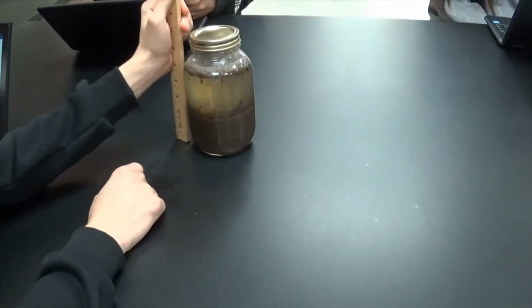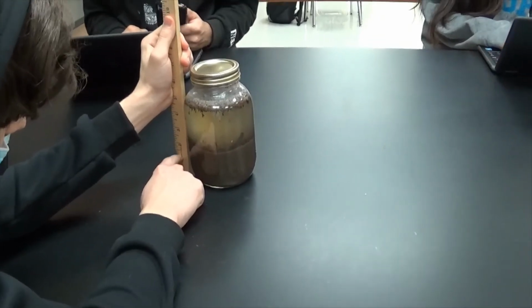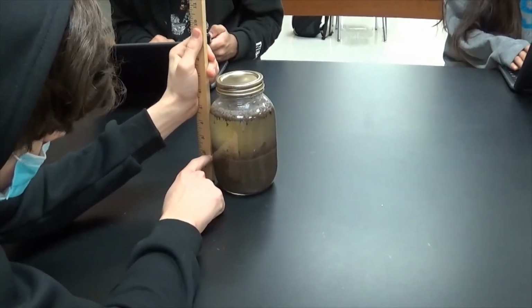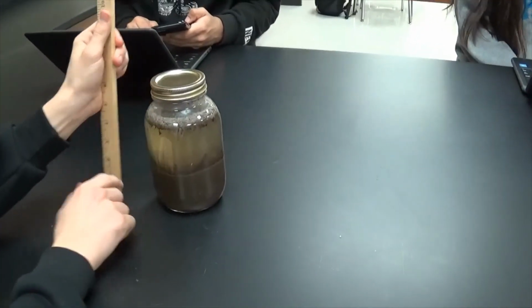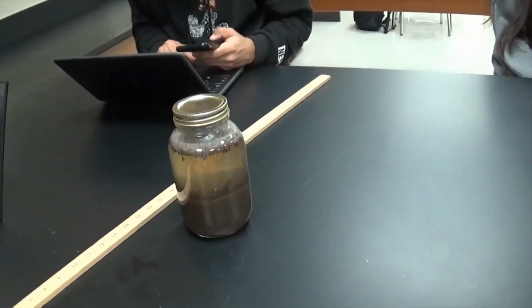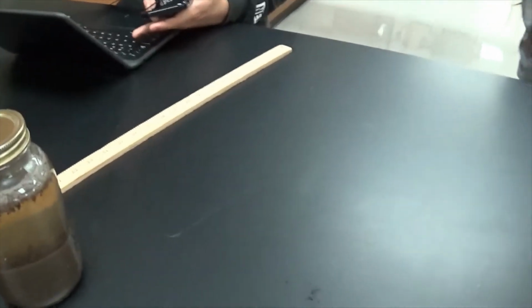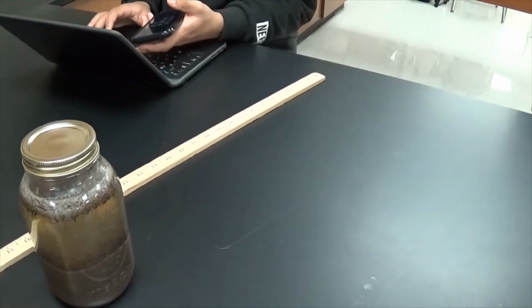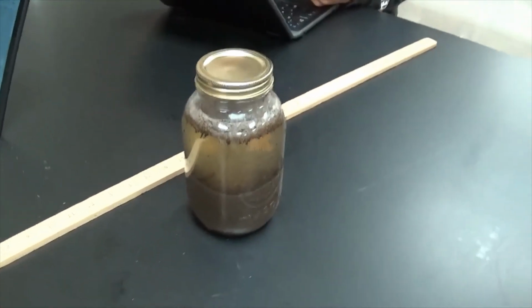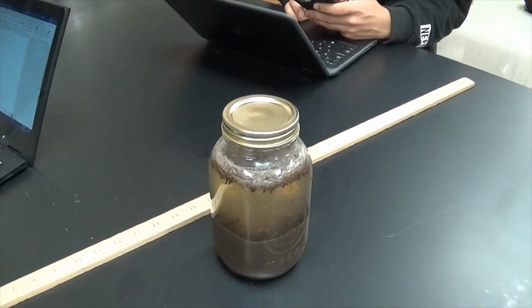I'd probably say half an inch, and then the sand would be half an inch, or I don't know. Okay, they're both the same. So go ahead and do another half inch. And what did you say the sand is? I would say the sand is 1.5. Okay, so the measurements for your soil profile are 1.5 inch of sand, half an inch of silt, half an inch of clay. All right, go ahead and use that to calculate your percentages, and then use the triangle to figure it out.